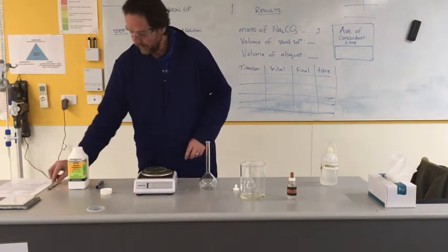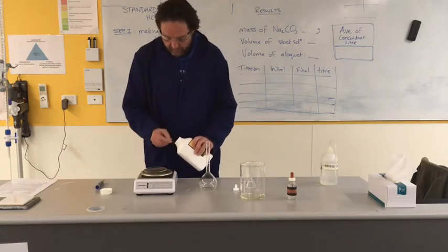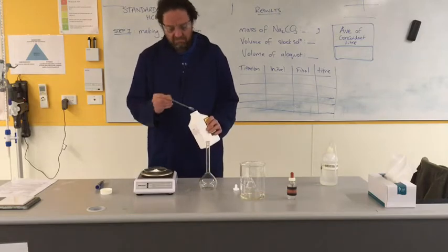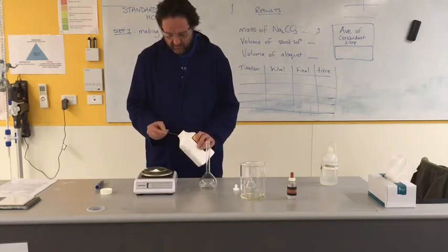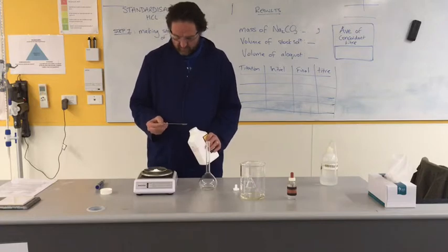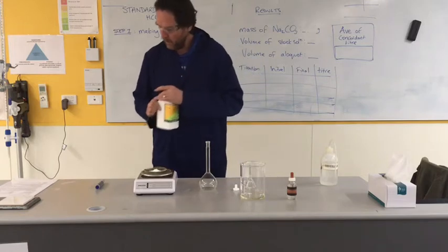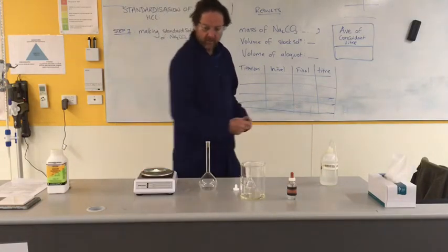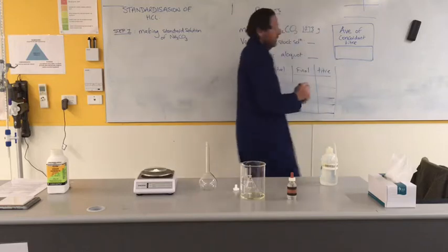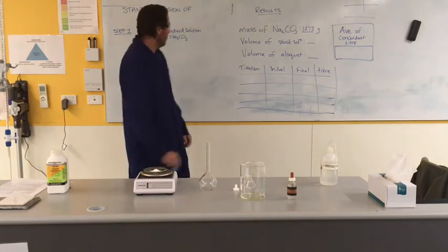I should be able to get three decimal places. I'm going to weigh accurately but approximately 1.3 grams of this - think about what 'approximately accurately' means. So if we just pour a little bit on, a little bit more, a tiny bit more. That'll do me - I'm aiming for around about 1.3 grams. That says 1.273 - that's definitely close. So I have got 1.273 grams of this anhydrous sodium carbonate.